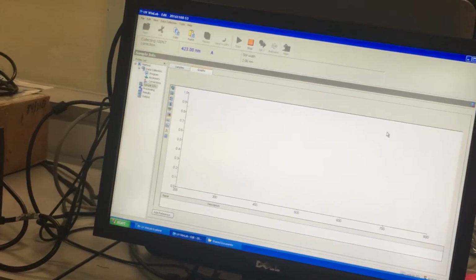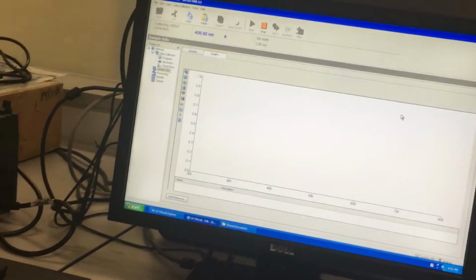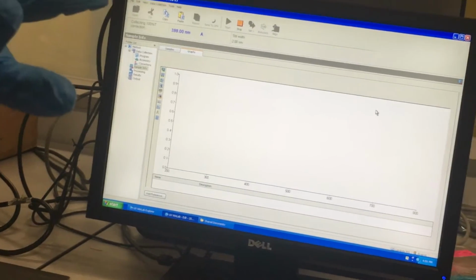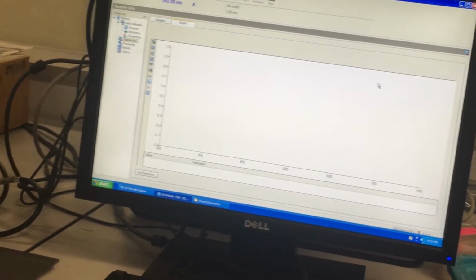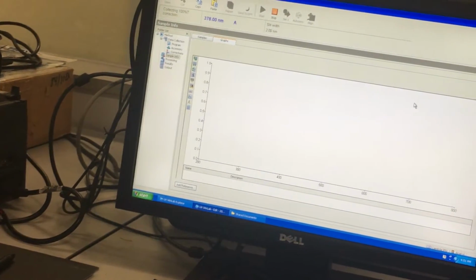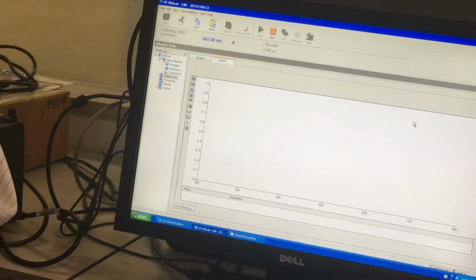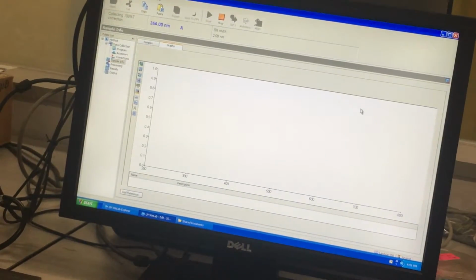Light consists of a coherent spectrum or an incoherent beam, or we call it an incoherent ray. Okay. So in the scientific way, we call it a photon. Photon consists of internal energy. Right. So how to calculate the photon energy? There are equations, right?